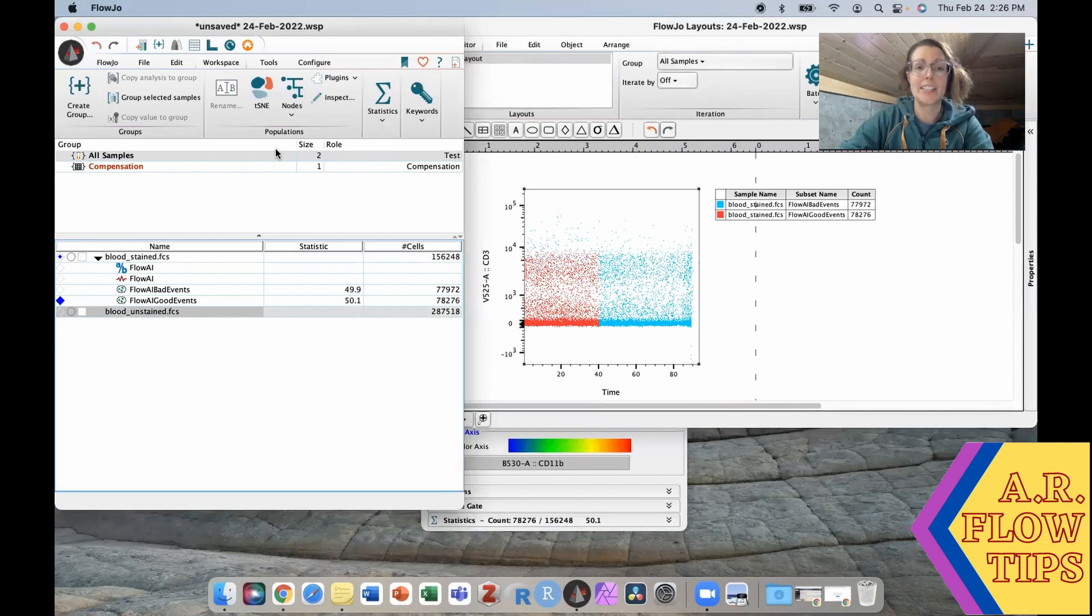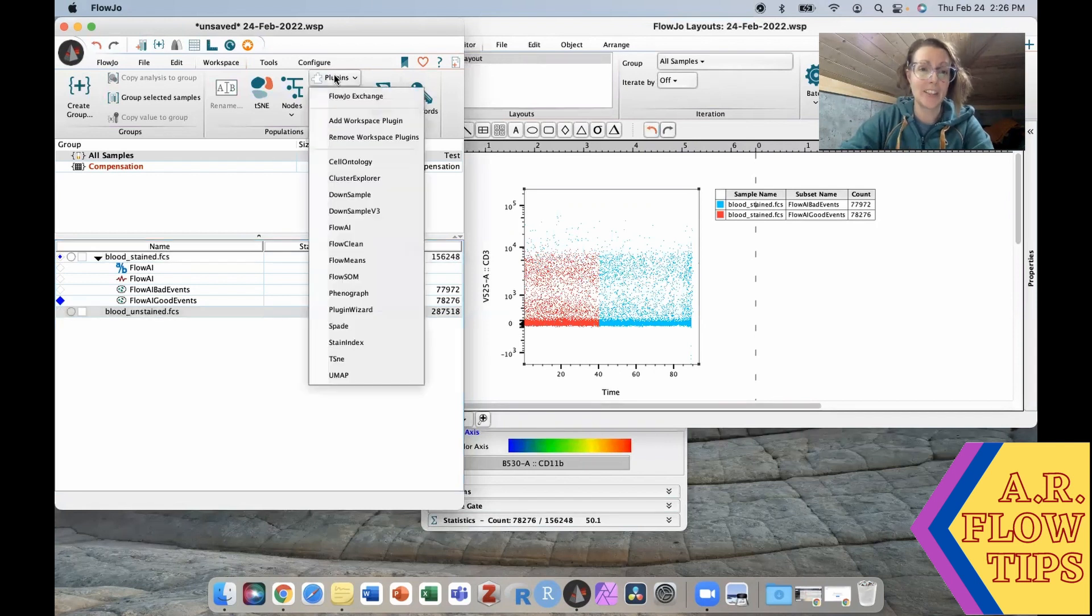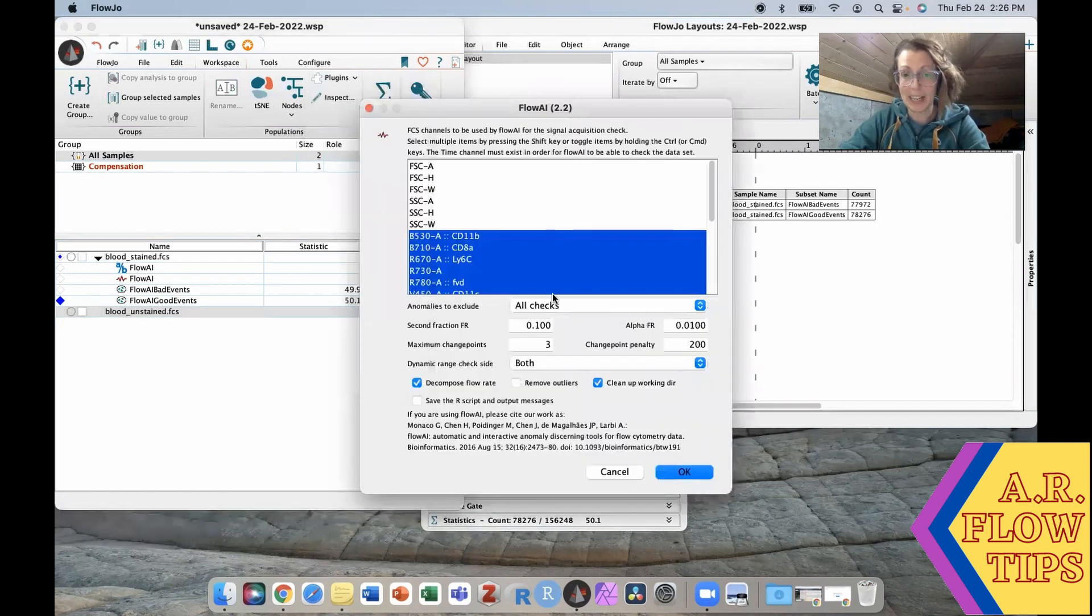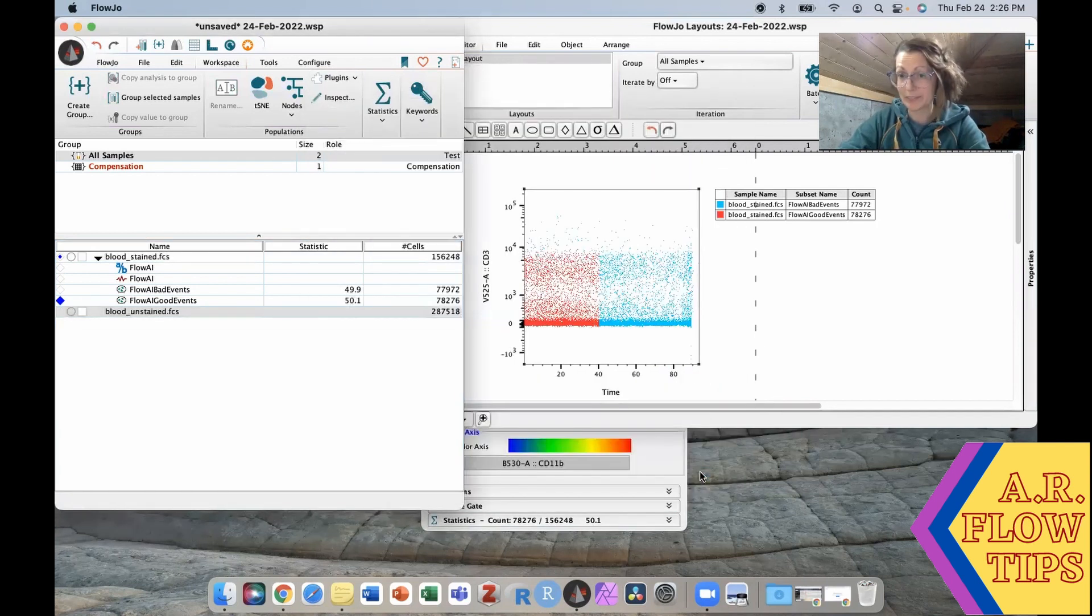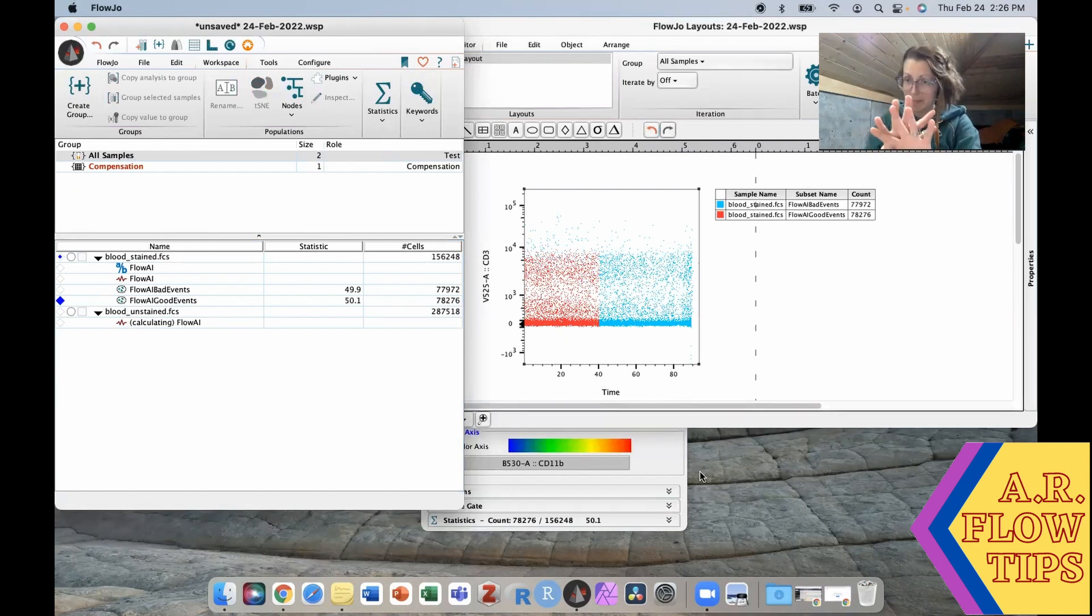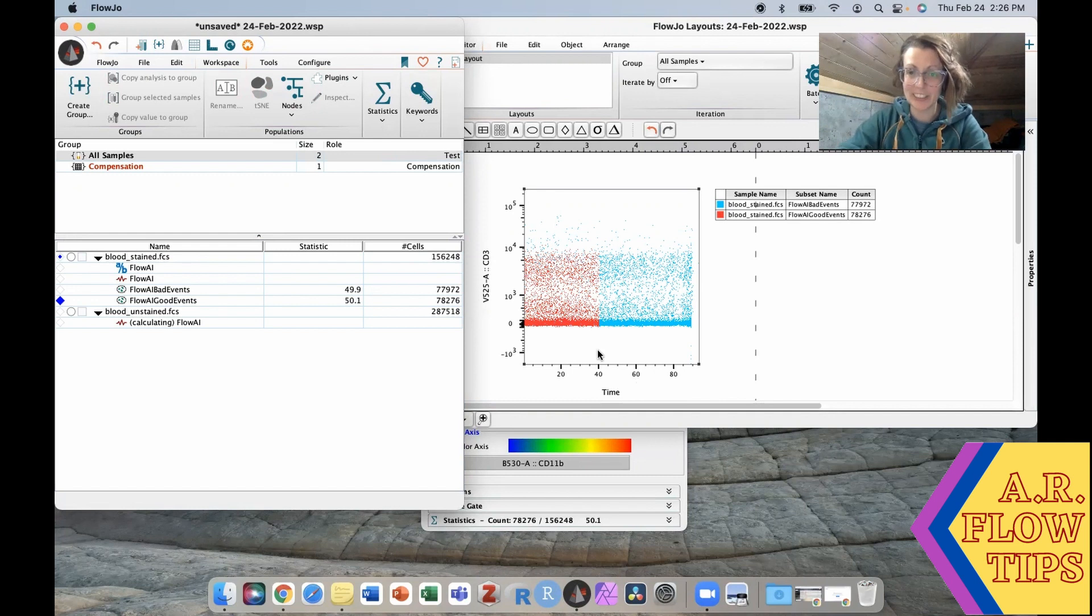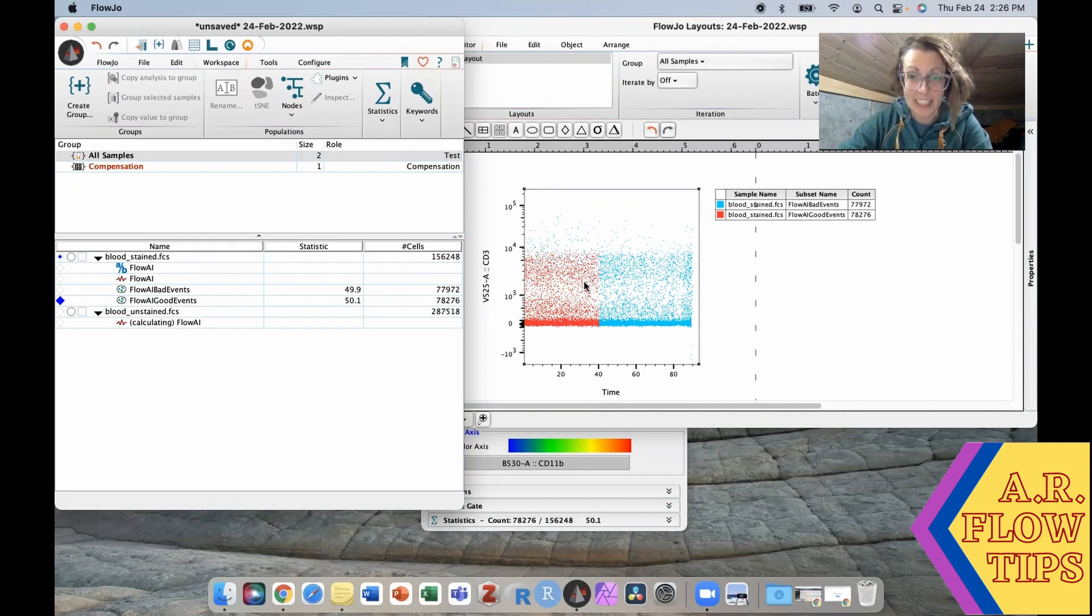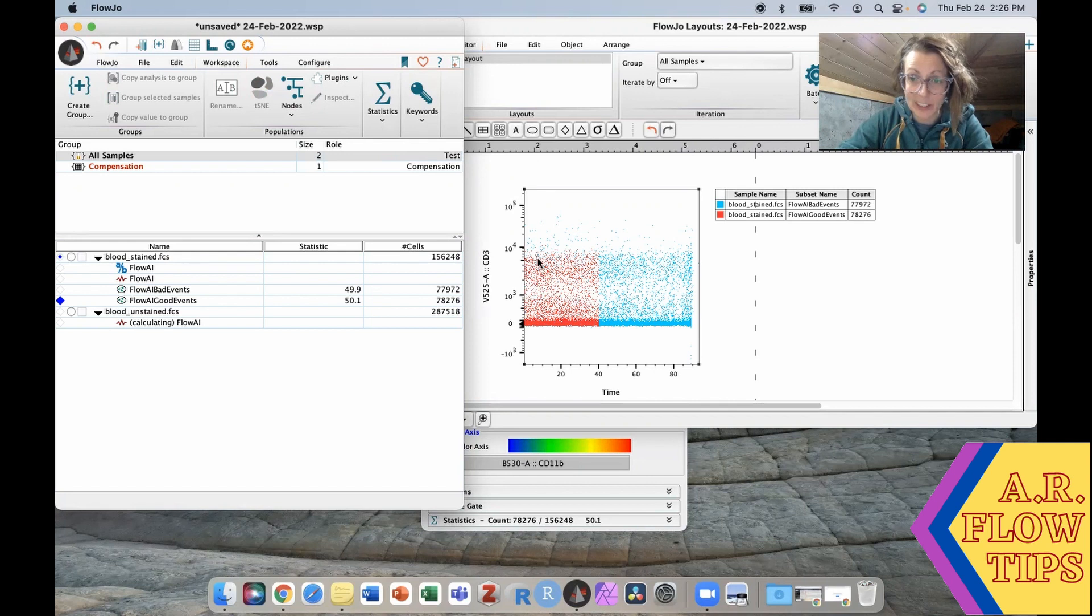So let's take a look at this other sample just to see what happened on that one. Because normally they're a little bit more mixed in together, it's not quite so cut and dry. So you can see a few blue events, bad events in this red area.